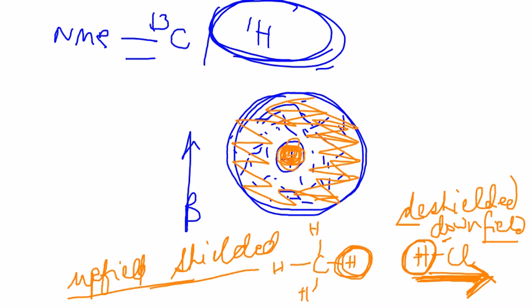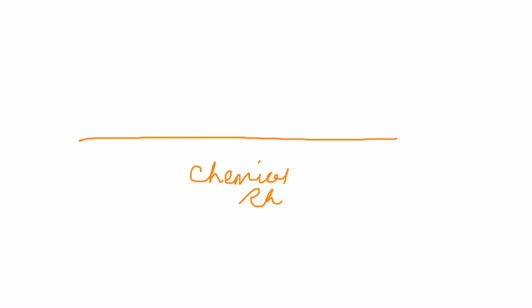Let's see what will be the result of this. Now, all NMR values are reported on what is called the chemical shift or delta scale. Chemical shift or delta. It varies between 0 and 10 for the most part. So this is the same as IR, in which our sample basically showed wave numbers, lambda bar, and it varied from 400 to 4000. This is going to vary between 0 and 10.